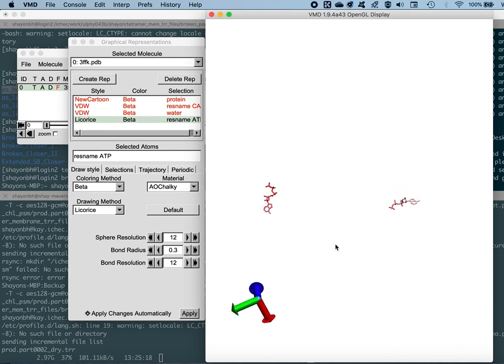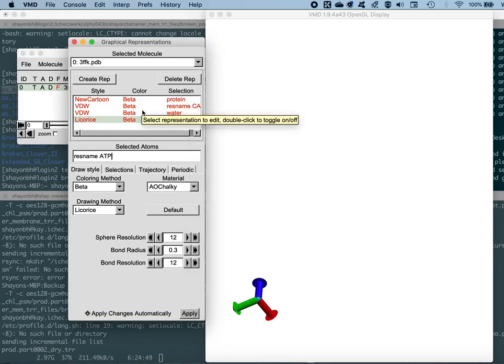So these are very, very stable because, first of all, they are bound to the actin protein. And secondly, they're also bound to another calcium ion on that site. All right. So that's that.